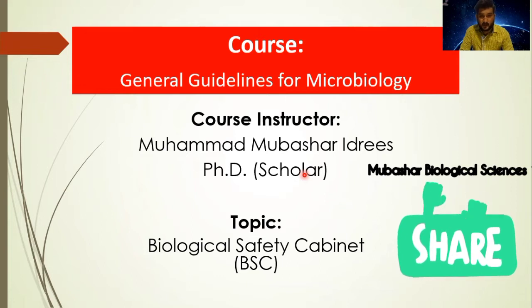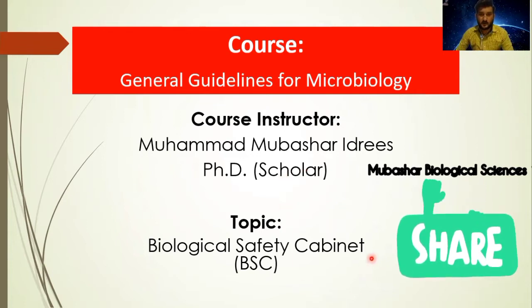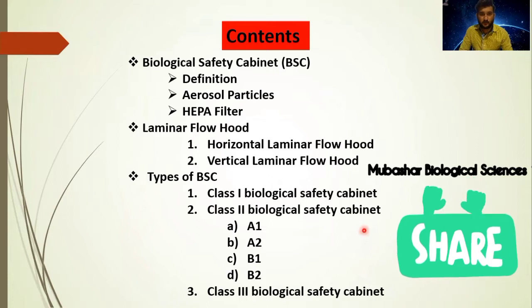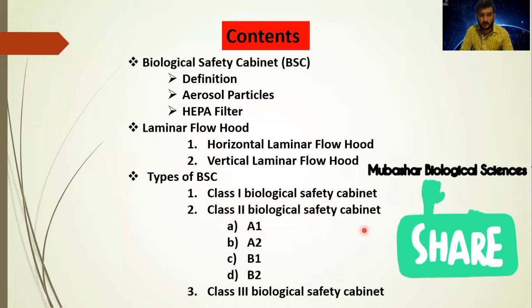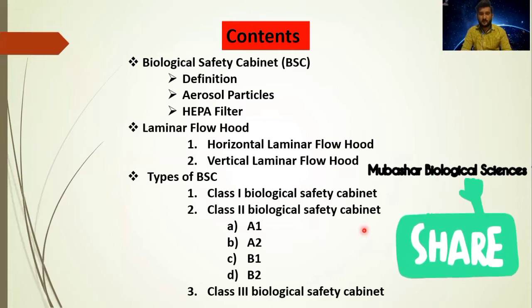Biological safety cabinet is very important for medical lab professionals, medical lab technologists, biomedical engineers, and also for infectious control. In this lecture we will see the biological safety cabinets and its types like laminar flow hood and biological safety cabinets. Biological safety cabinets are divided into three classes: class 1, class 2, and class 3. Class 2 biological safety cabinets are further divided into four sub-classes: A1, A2, B1, and B2.